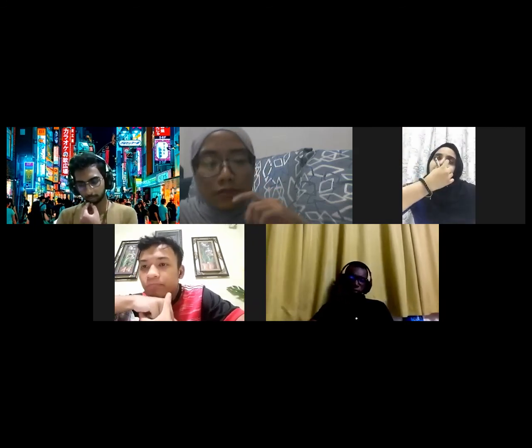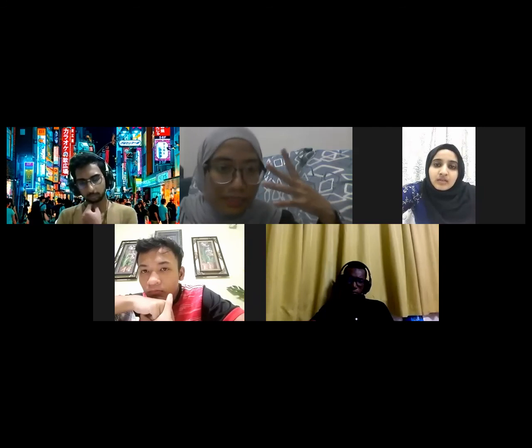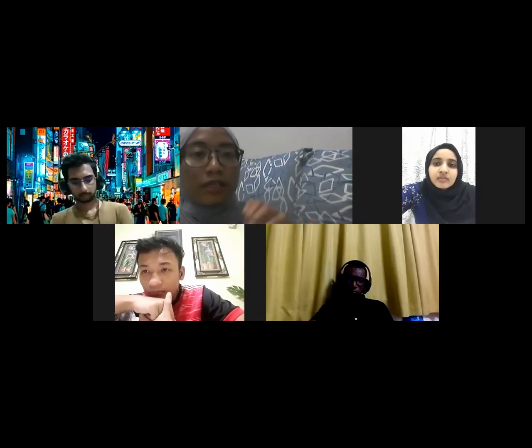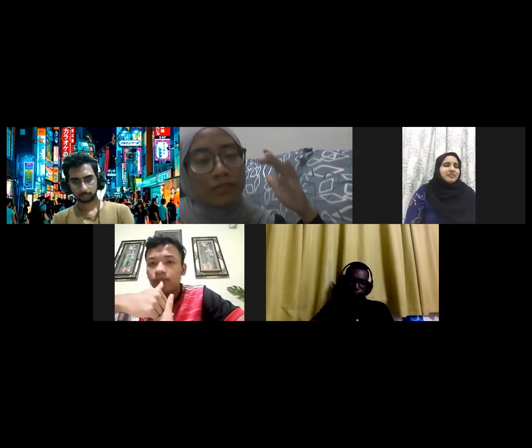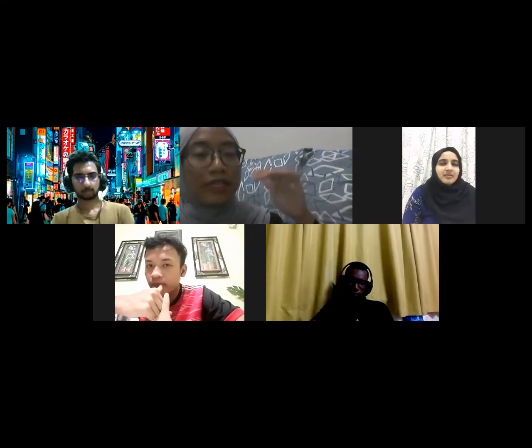Like just now, Shafiq's one also. For example, the self-complementary is 2, which is okay, I guess. Still lower than most of what we got, because some of us got 6. It's quite high. But I think we need to check again how maximum it should be, if it's really that bad.